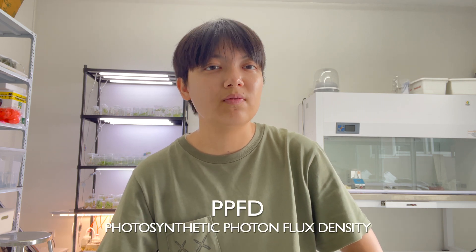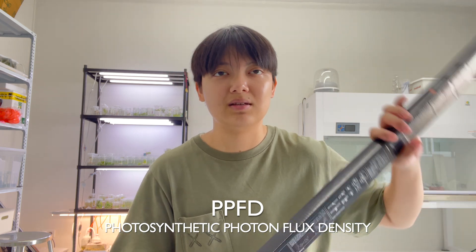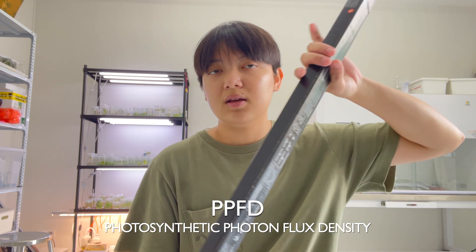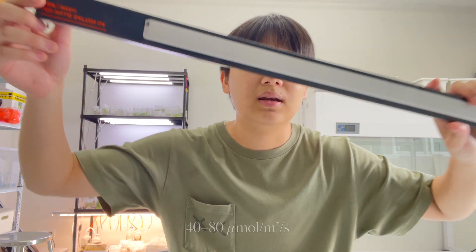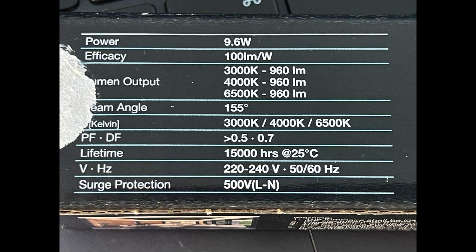Now let's talk about how much light your plant needs. You can measure that using PPFD — Photosynthetic Photon Flux Density. For tissue culture, you don't need super intense light, just around 40 to 80 micromoles per square meter per second.